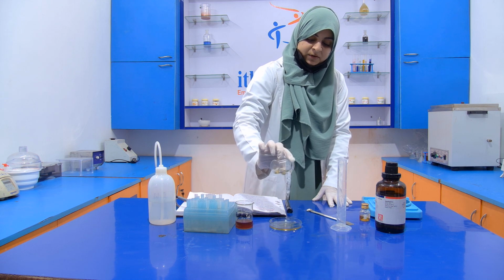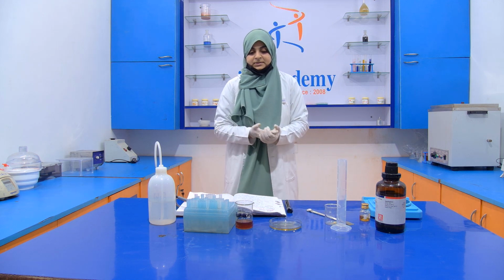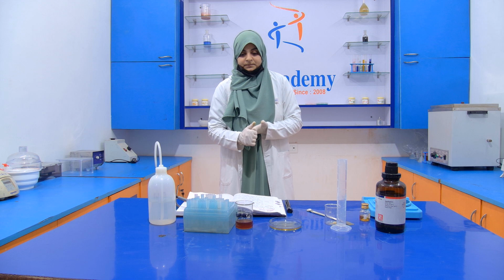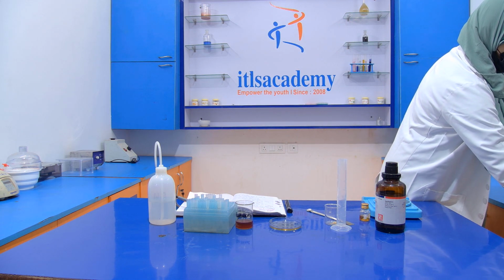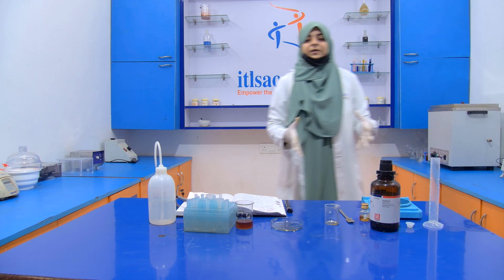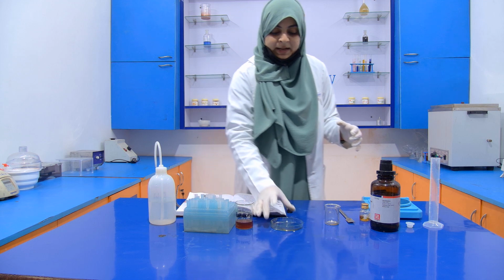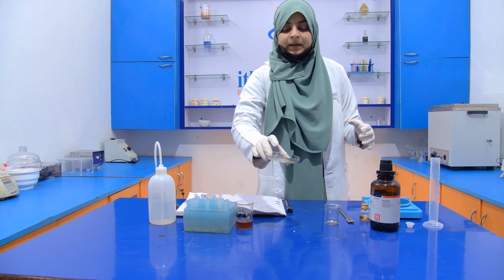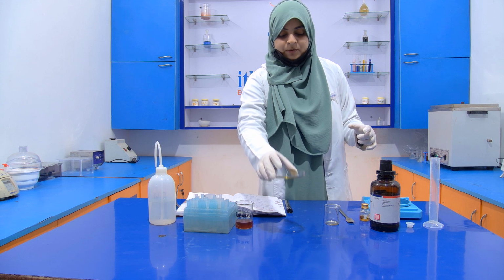Now we have to leave it for evaporation. After some time, the ether has evaporated and we only get the residue. See that in the petri plate, the residue is there.